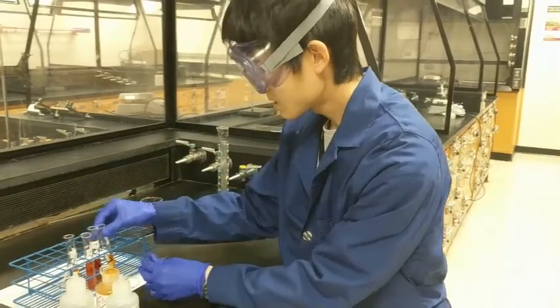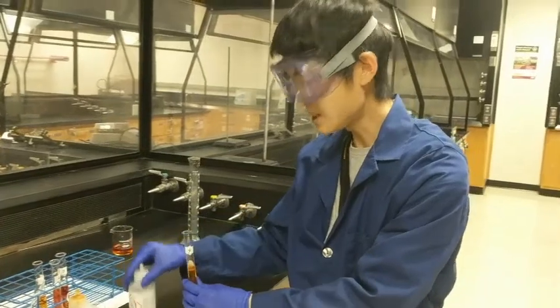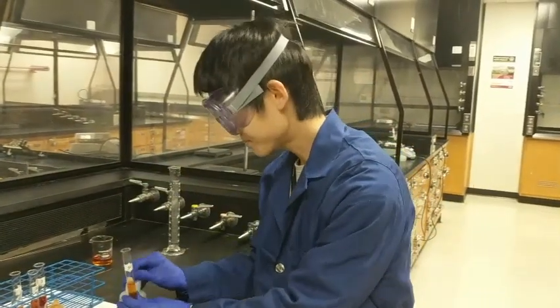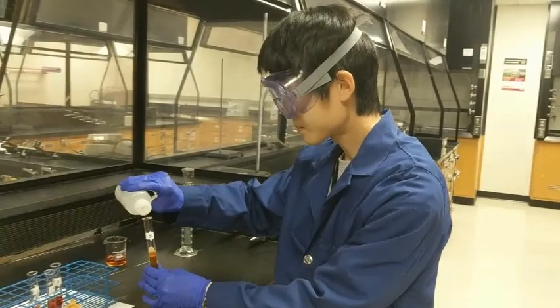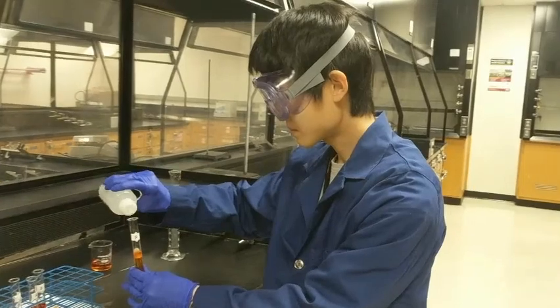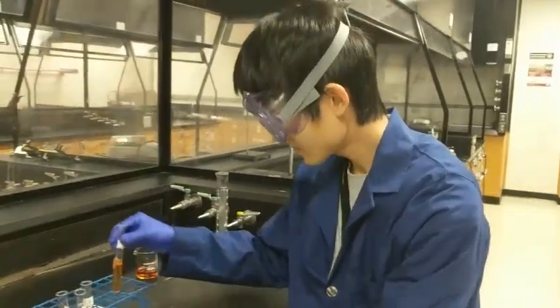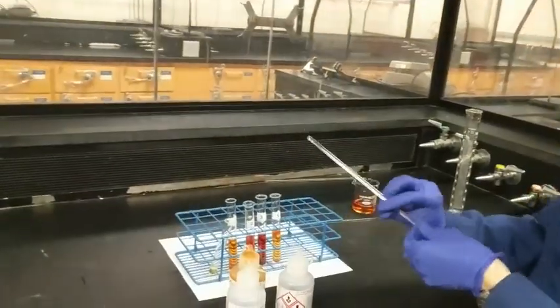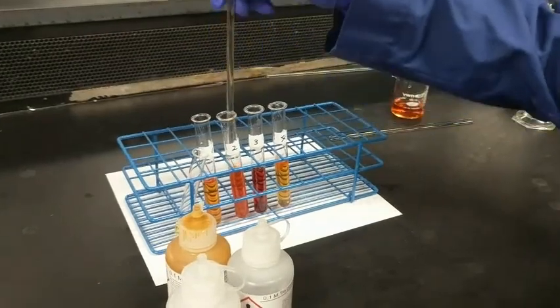For the last test tube, we're going to add tin(II) chloride solution. Now, using a glass stirring rod, we're going to gently mix the solution together.